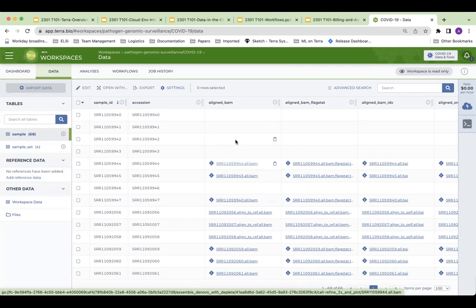Can I ask you one question, Anton, just about the sample tab? My understanding is that in these data tables, you can't have more than one group of samples. Otherwise, it needs to be a separate workspace. Is that right? Like if I had a group of my own samples and then a group of TCGA samples, and I didn't want them in the same table.